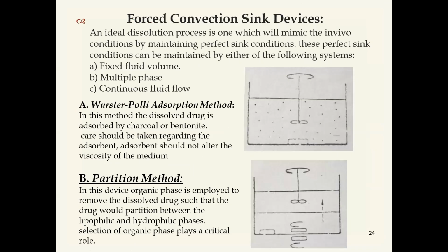Next one, forced convection sink methods. Previously I discussed everything about non-sink methods. Now I will discuss forced convection sink devices. I already explained what is non-sink, what is sink. In vitro dissolution test models can characterize the dissolution process.